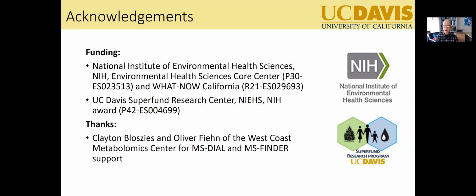And as I mentioned, a lot of the methods that I talked about here were developed under the auspices of our Superfund Research Center that's cited here. I didn't list them on the authors, but as you'll see in a minute, they're an author on the paper that we recently published. The West Coast Metabolomics Center has been really helpful in helping my lab adapt and transform MS-Dial and MS-Finder for these kinds of applications. And in particular, Clay Blozis and Oliver Fiehn have been really critical to this effort.